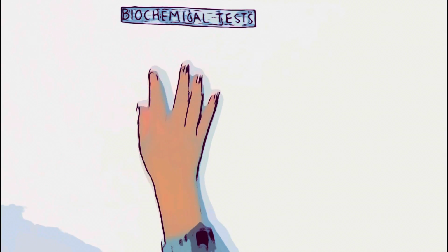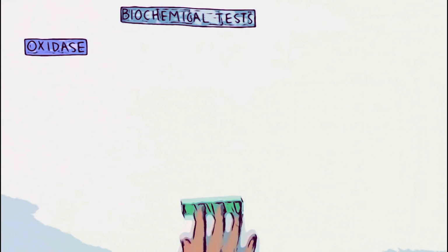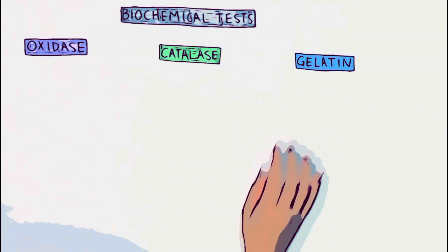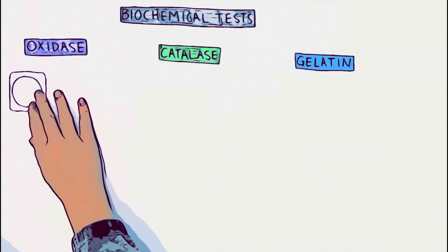The final tests that were done on our isolates were biochemical tests. The 3 tests done were the oxidase, the catalase, and the gelatin test. These tests are also done to further understand the status of our bacterial isolates.